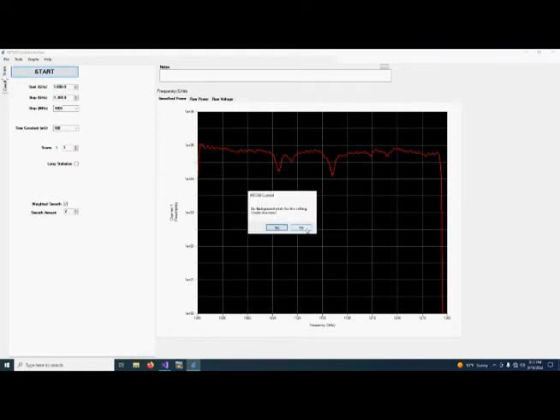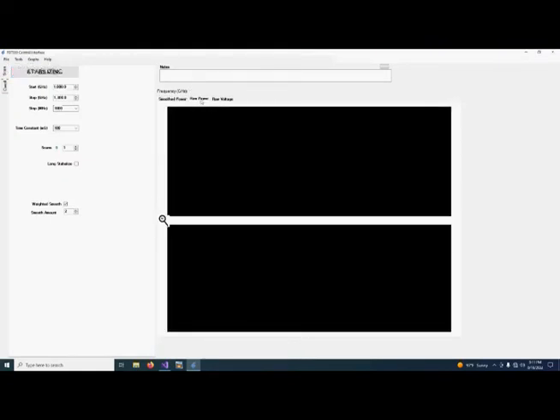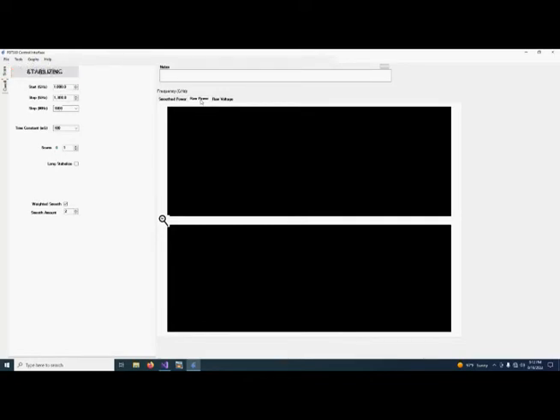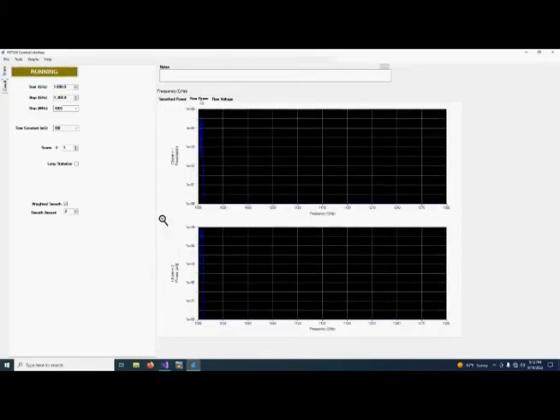And if you start taking the data, it looks like noise or it's very irregular. It doesn't look like noise. But there is no nice consistent fringe pattern. Historically this meant you weren't going to see very good data and that you were sampling the fringe pattern off and on, which meant you wouldn't see nice low signal to noise ratios.